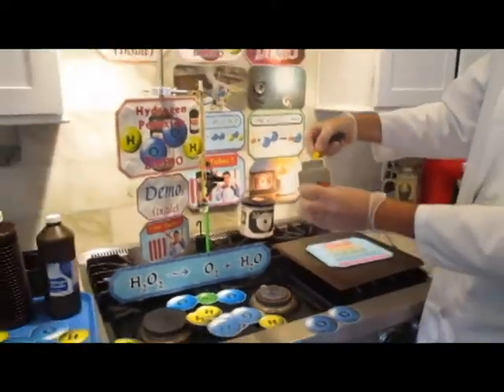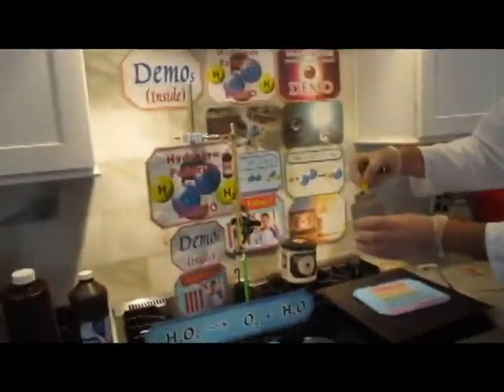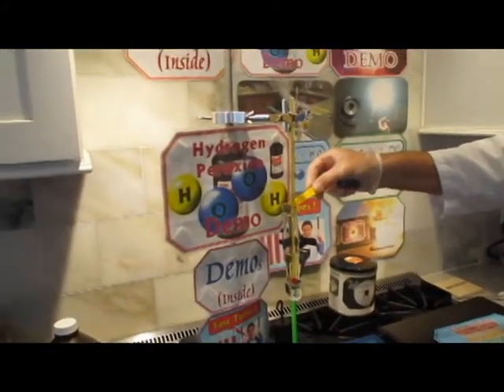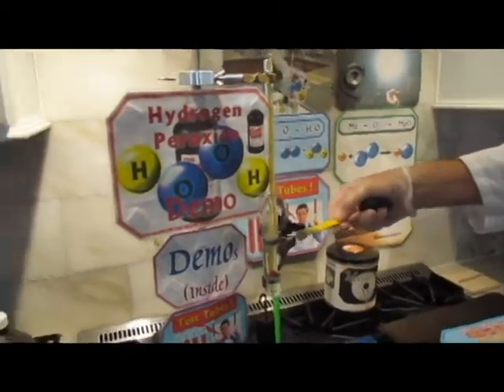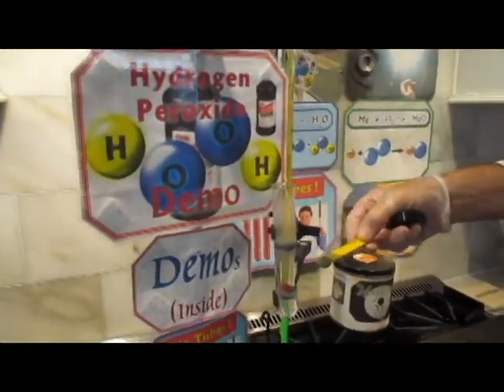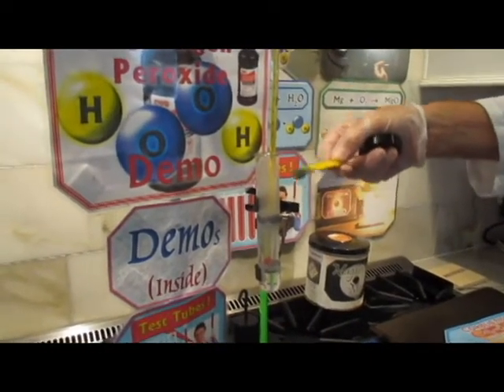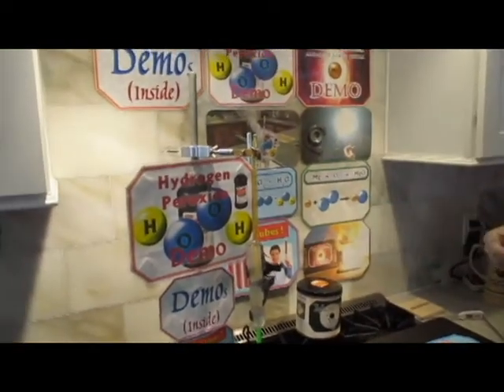So what I'm going to do is I'm going to add some, and we're going to see this reaction accelerate, because this is a catalyst. So watch, I'm putting a little more in, a little bit in. Now notice, we see a reaction. It's happening way faster now because of the catalyst. Also, you see some sort of fog developing there. So that looks like that should be oxygen, right?